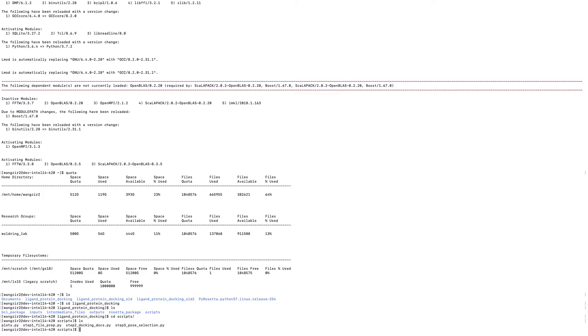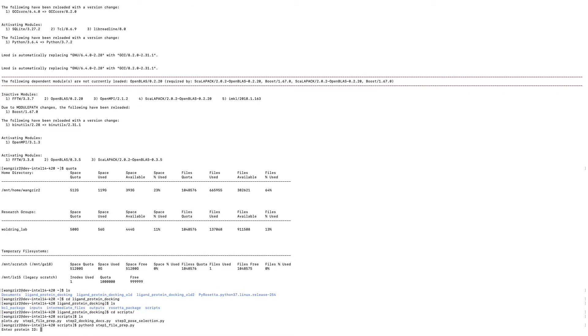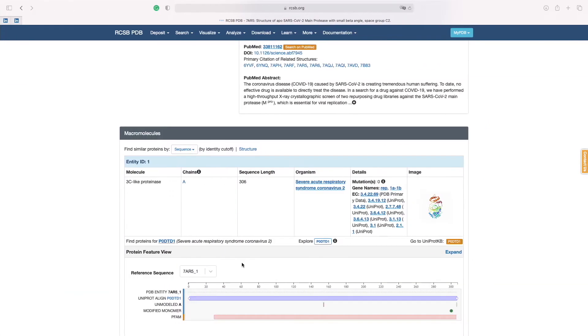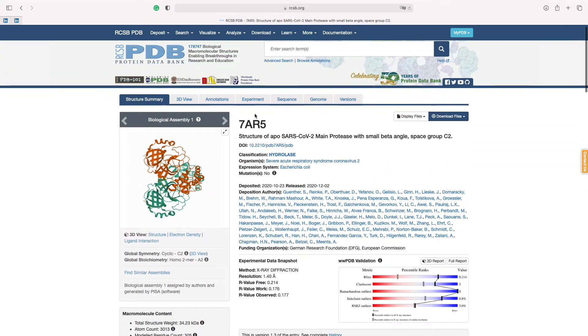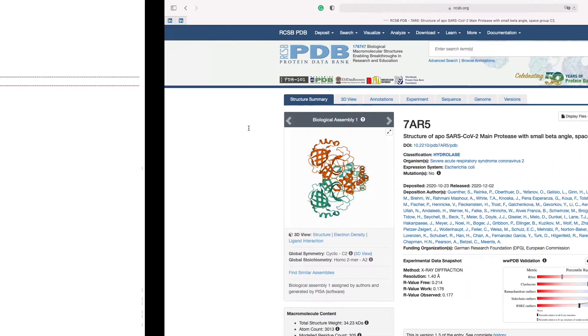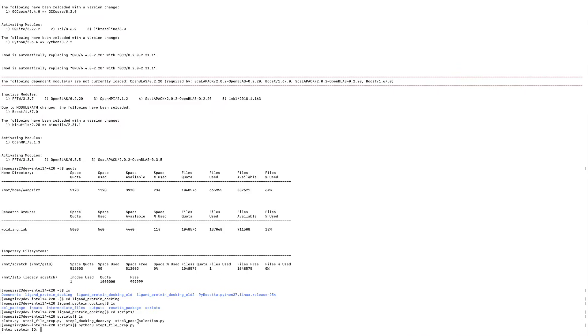Okay, let's go ahead and type Python 3 and give the file name step1_file_prep.py. Okay, enter. And enter the protein ID. Like I said, our protein is 7AR5.